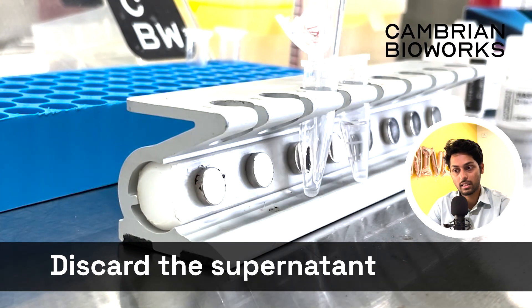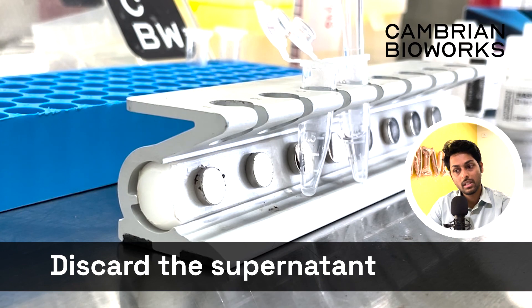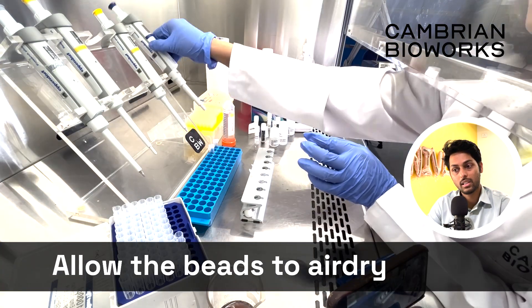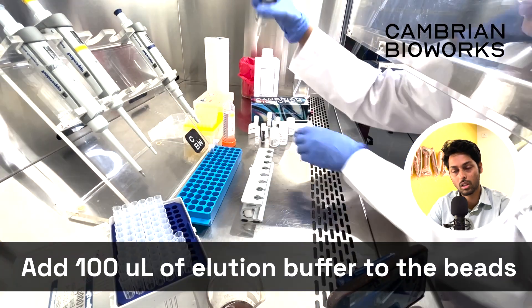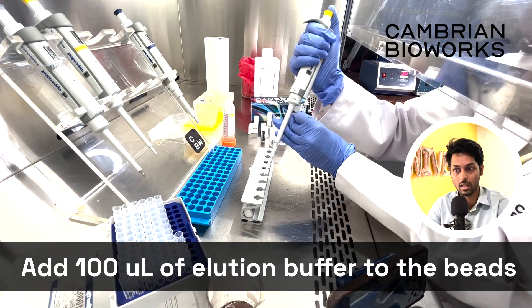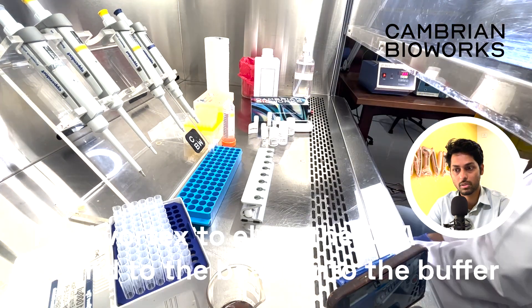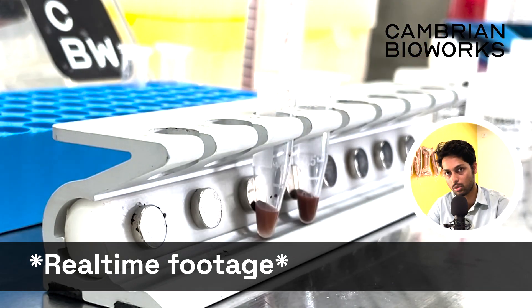Remove the final supernatant and allow the beads to settle. Once the beads are settled, they should also be allowed to air dry. Air drying is one way; some people tend to heat it to a certain temperature for a smaller amount of time — that's also okay, as long as it's not too harsh or too high a temperature. Once that is done, add your preheated elution buffer onto this mix.